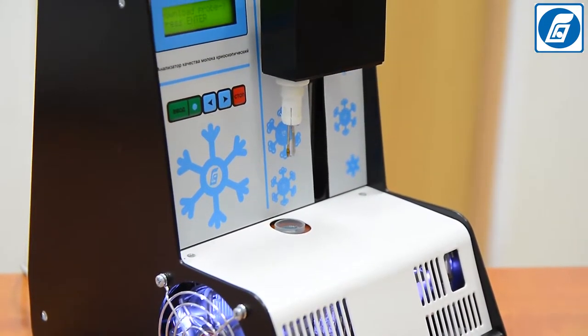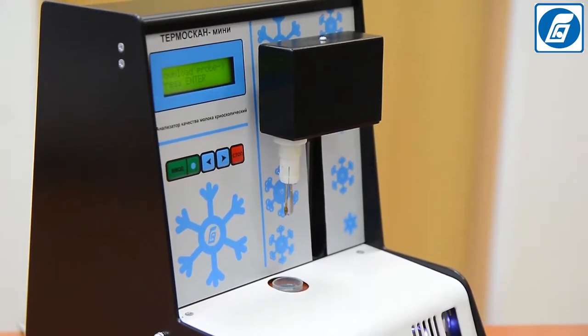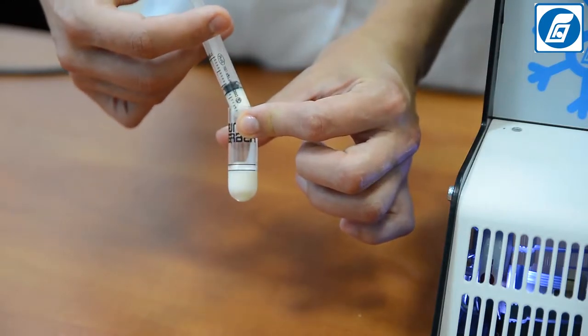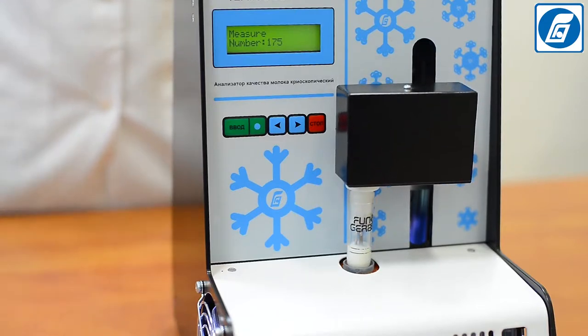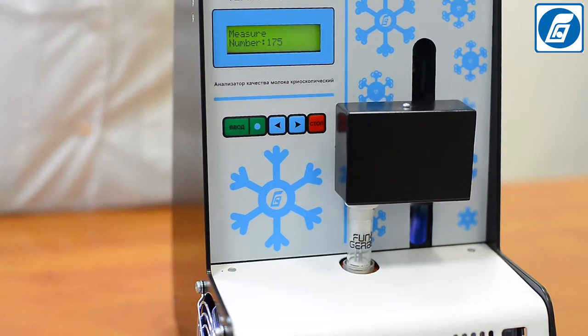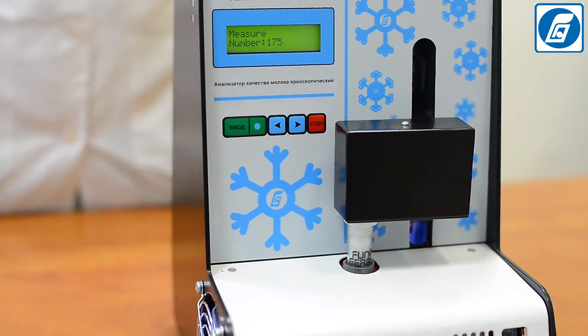Affordable price and short payback period. Does not require daily calibration. Temascan Mini is intended for quick determination of the freezing point — the freezing temperature of milk — by the Thermistor cryoscopic method, which is a reference arbitration method for freezing point determination, more accurate and a priority method compared to other indirect methods of analysis.